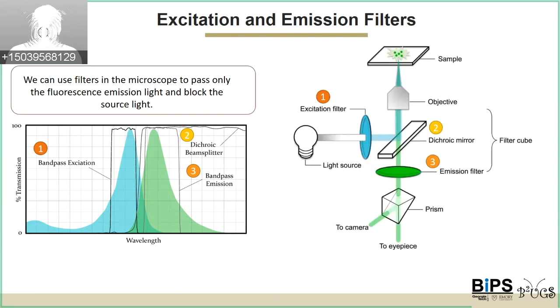So let's see how this looks in the microscope. One is the excitation filter, called a bandpass here because it only passes a band of wavelengths. This could be used, for example, if you had a broadband or multicolor source like Nish talked about. But your fluorophore will only be excited by a narrow band of that source energy. You'll filter out all the wavelengths that you don't need, so you don't put a bunch of extra energy into the sample. You care about this because the additional light can excite other molecules that you aren't interested in, leading to damage in the sample called photodamage.